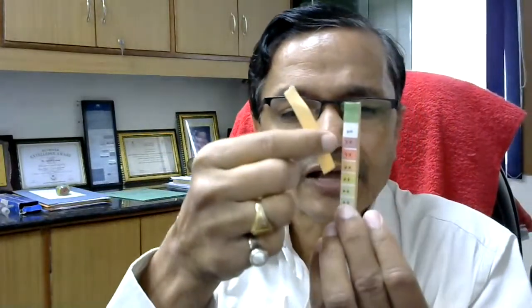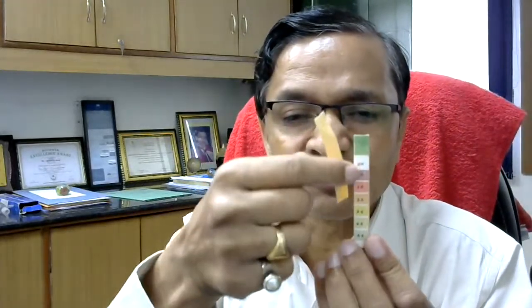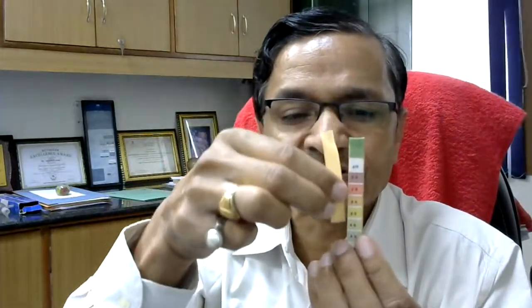When you dip it into the solution, depending on the pH, it will change color. Whatever color is there, you have to match with this chart and then find out. According to the color, the pH value is also written. So depending on the matching color, you can find out roughly the pH of that particular solution.